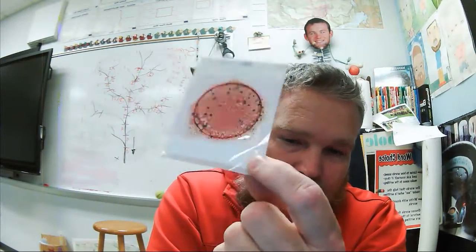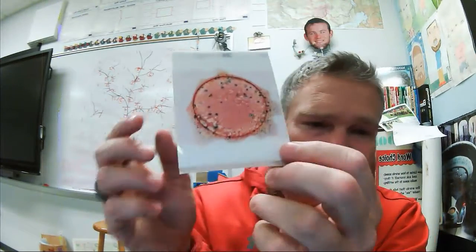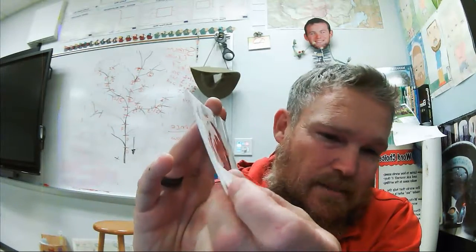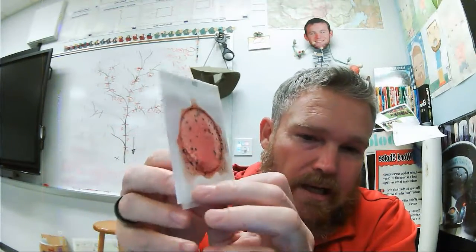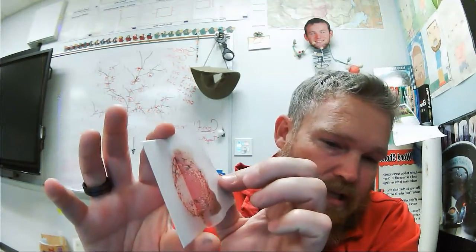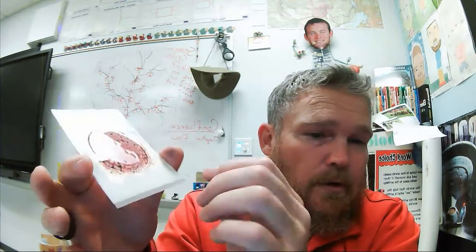So basically, with this, what we then do is we take these colonies and we can isolate them onto Petri plates, which I'll show you the result of that in another video, because those are waiting. So today we went in and we took a smidgen of these colonies. Looks yummy, right? And we're trying to isolate them on another plate. And then next time we're going to come in and look at them underneath the microscope to see what they look like. If we know what they look like, then that would kind of give us where tests would go next.